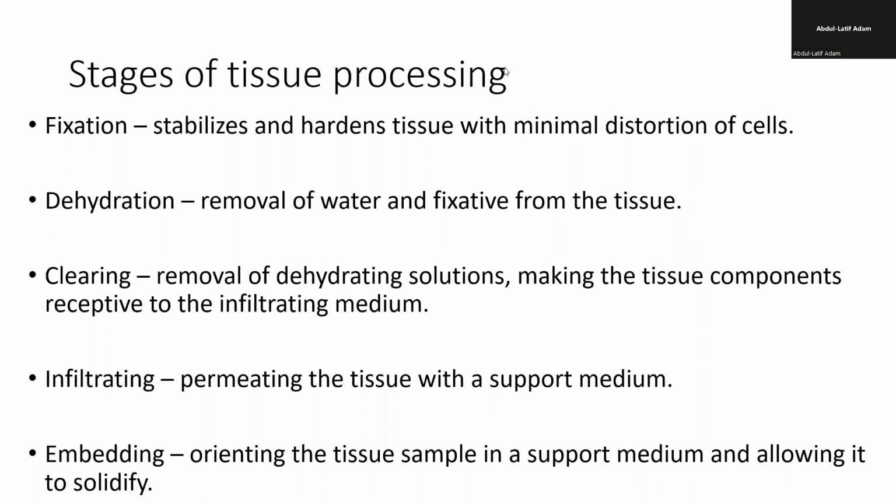So it starts from dehydration. And dehydration by its name means removal of what? Free, unbound water from the tissue. Removal of free unbound water from the tissue is dehydration. And then after removing the water, I mentioned to you that the tissue is going to be preserved in a medium.